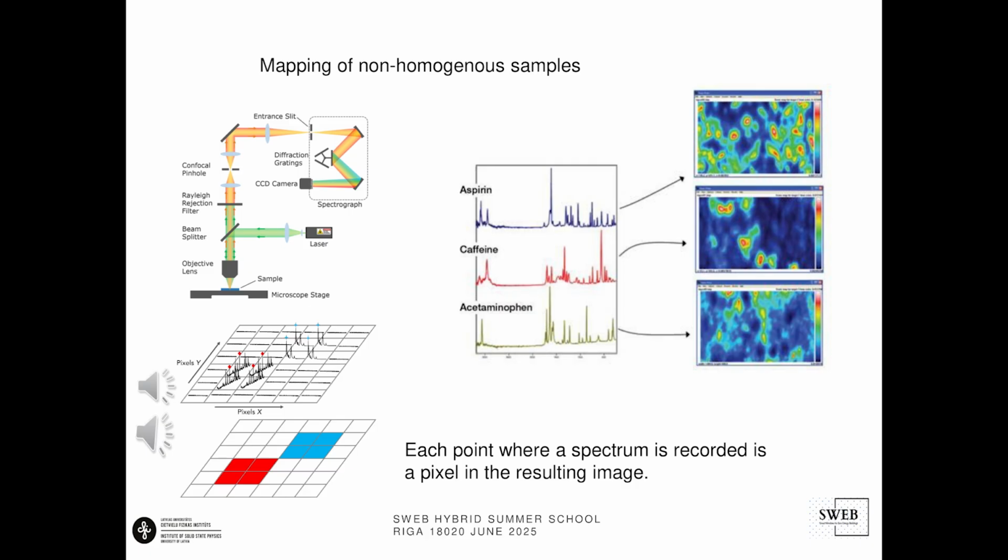Raman mapping of a sample area provides information about the chemical and physical differences across a sample. Raman imaging can be performed across a two-dimensional plane or three-dimensional volume. Raman imaging allows for material identification, quantitative analysis, the detection of strain and crystallinity, and layer number in quantum materials. Raman images are acquired using a confocal Raman microscope.